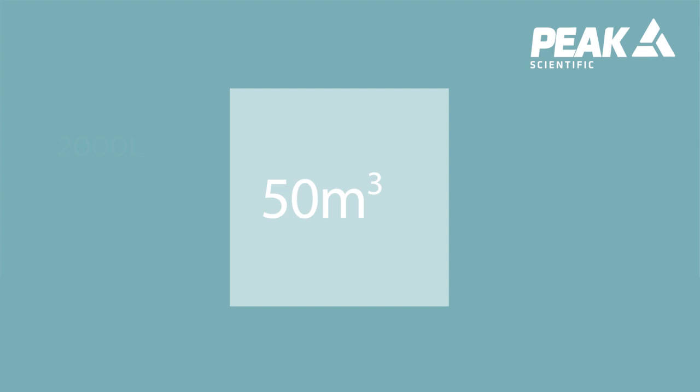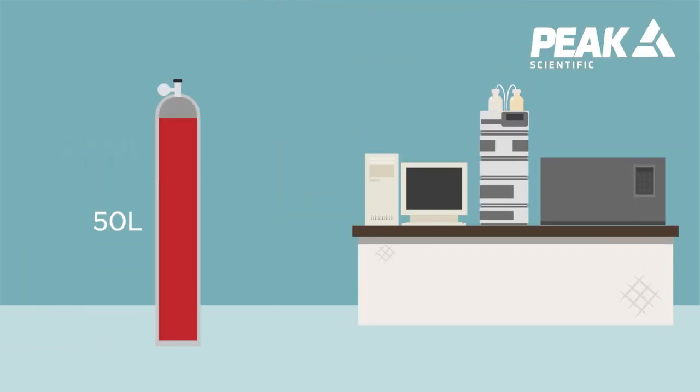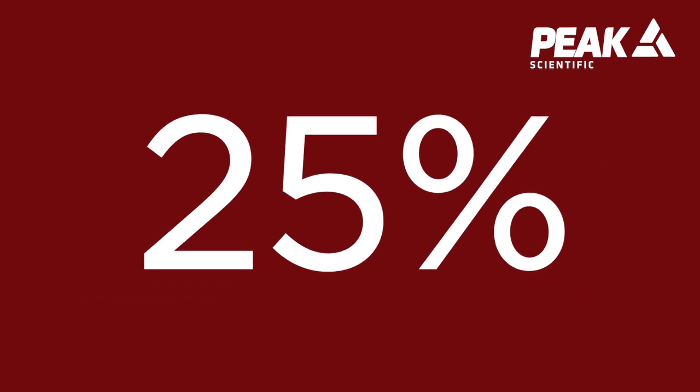In a small lab with a volume of 50 cubic meters, a 50 liter gas cylinder would have to release just over 2,000 liters of hydrogen to reach LEL. That's only 25% of the cylinder's contents.